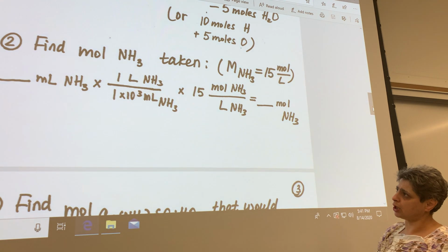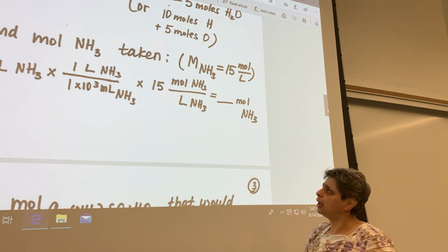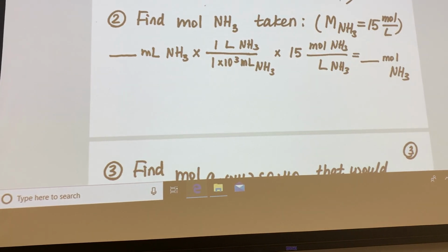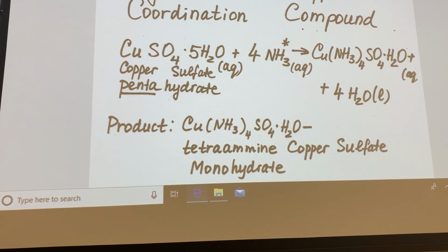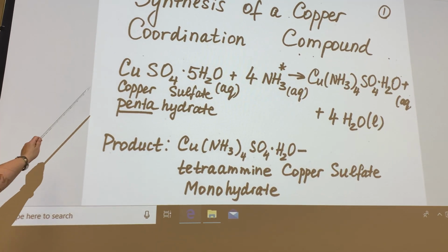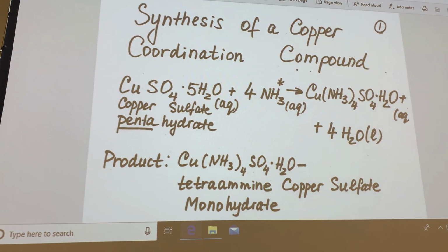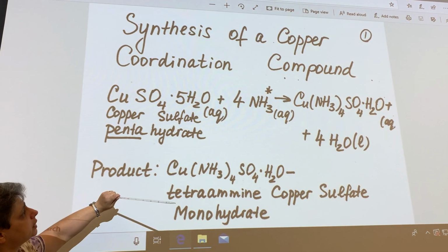used for the reaction. So now that you have moles of both reactants that we used, now it's time to start finding how many moles of product you could get. And this brings me back to the balanced chemical equation, which, by the way, is given in your lab manual, specifically on page 85. So you can use that for reference.